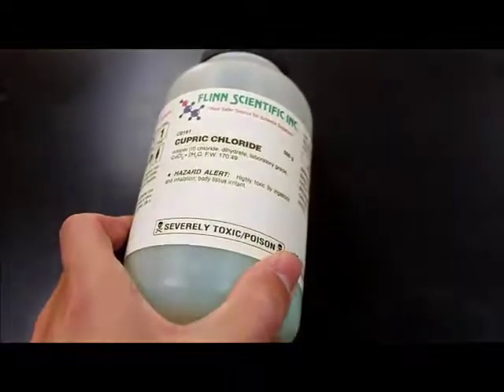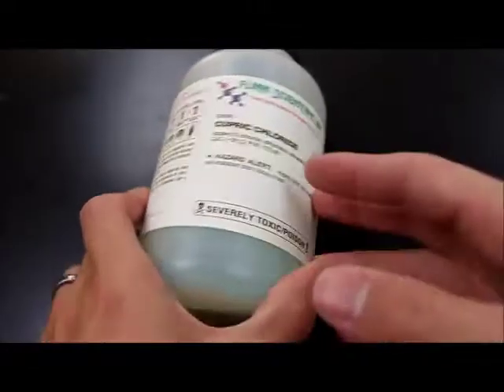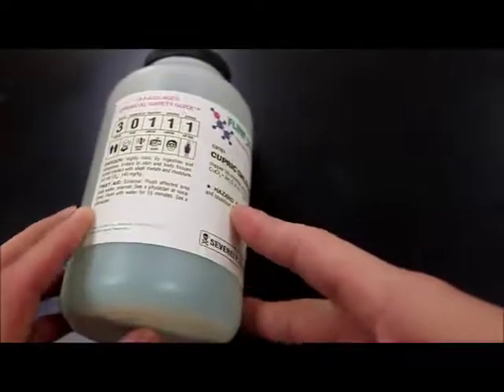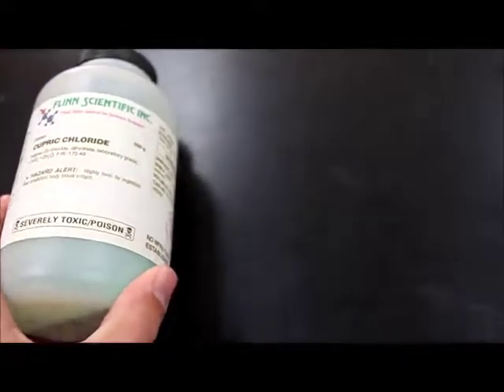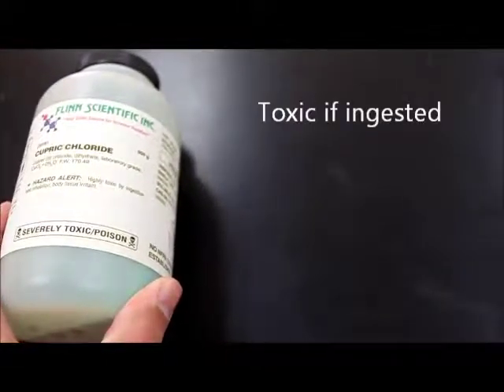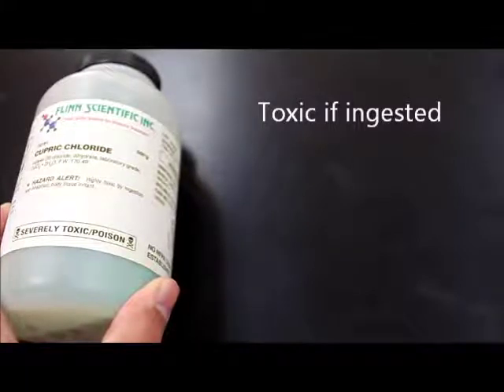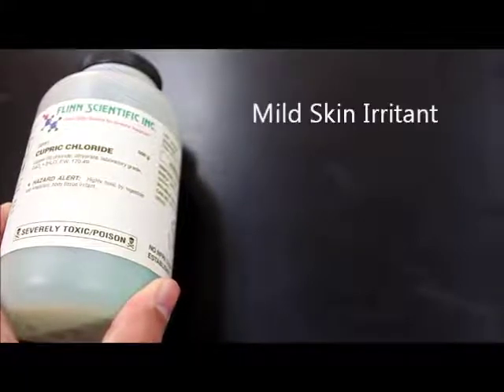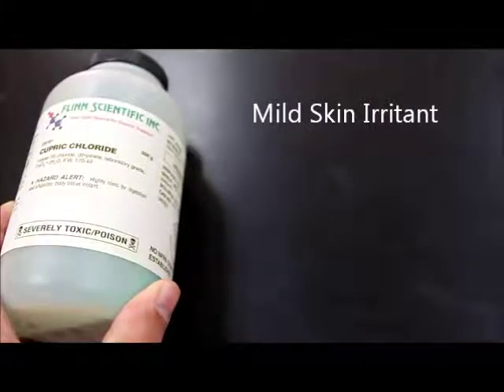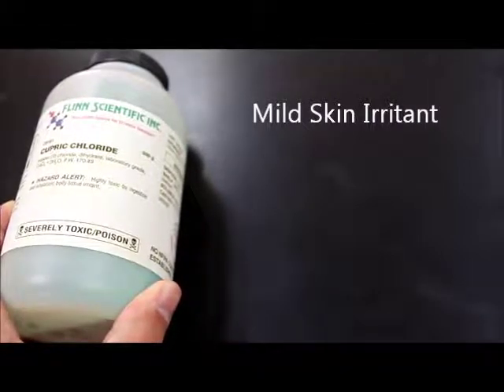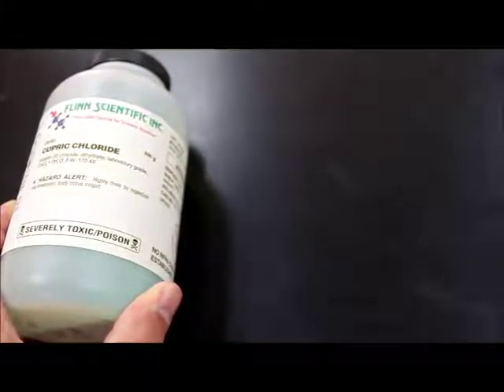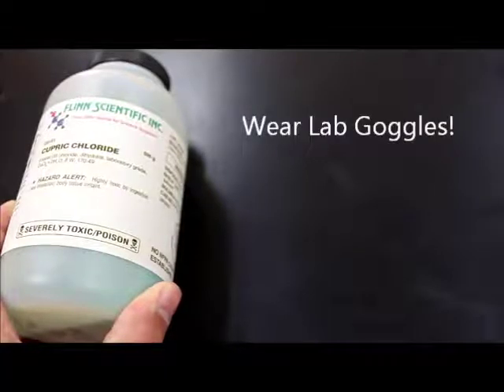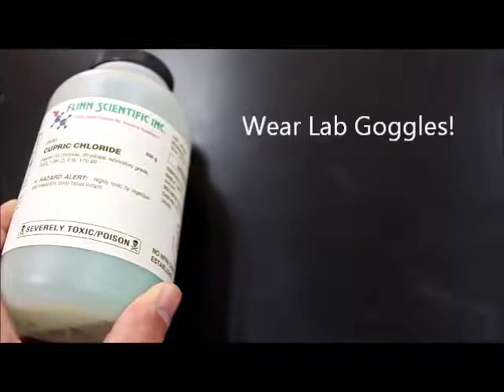As far as safety is concerned, one of the chemicals we're going to be using is our copper(II) chloride dihydrate. Looking at the safety information here, one of the concerns about our copper(II) chloride dihydrate is that this is toxic if you ingest it. So make sure first of all that we're not eating it. But it also is a mild body tissue irritant which means that if you get it on your hands and you don't wash it off your hands right away, it could cause some discomfort and some itching and so forth.